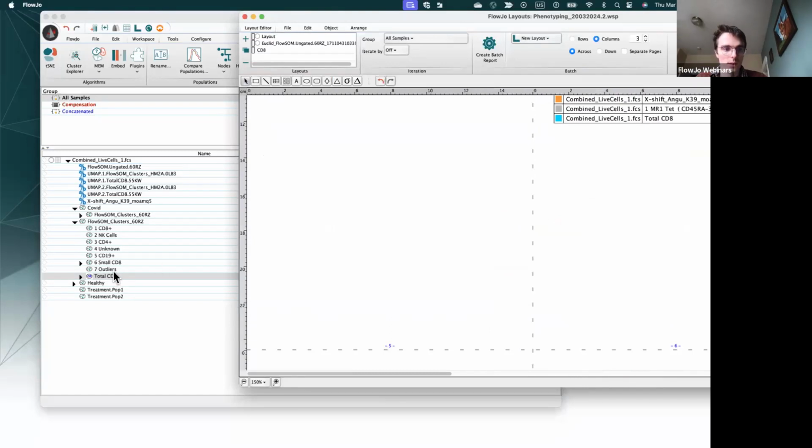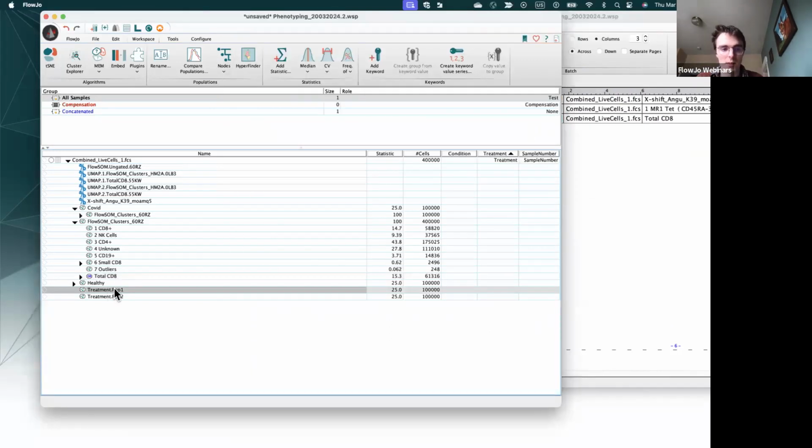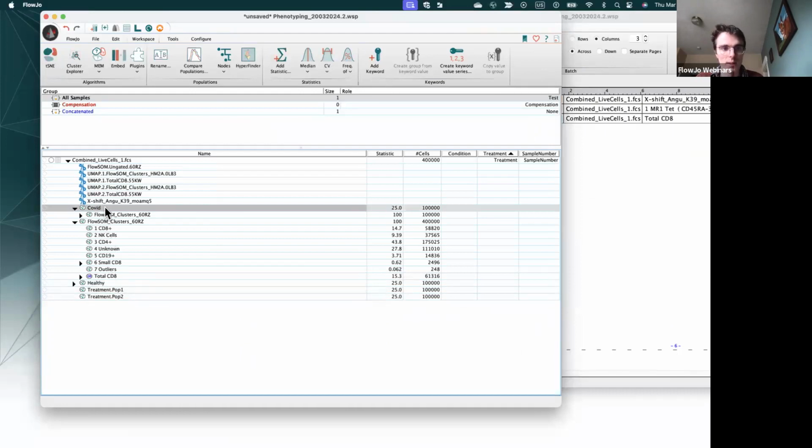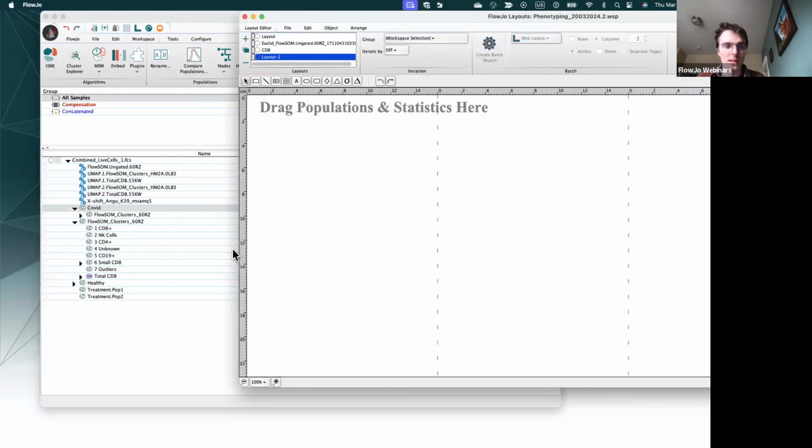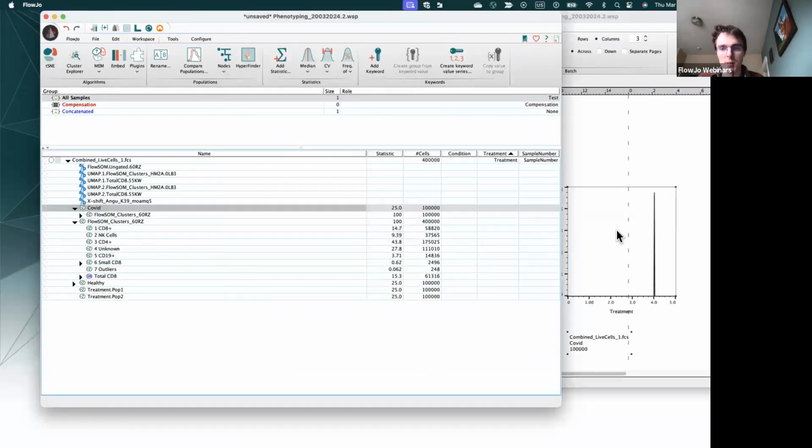And then of course the classic way you could look at these, at healthy and COVID. We could always make heat maps or make UMAPs as well. So let me just do that.